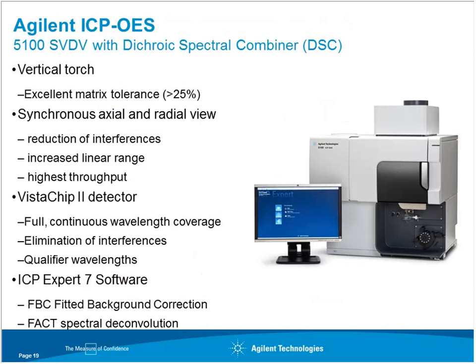So first we'll talk about compendial procedure 1, which is ICP-OES. I do just want to review the 5100 with you, and there is some new technology here that will be helpful to comply with these USP methods. I want to make sure that's understood. First, with the new technology comes some new terminology as well. We call this the 5100 SVDV, and that stands for the synchronous vertical dual view system. I think everybody knows what dual view is.